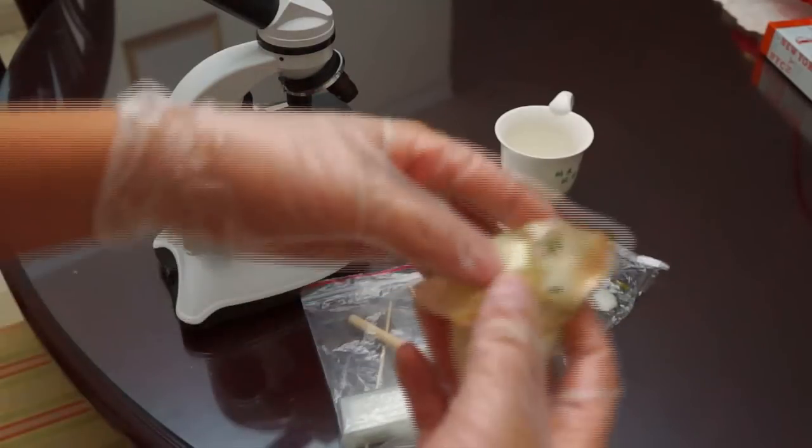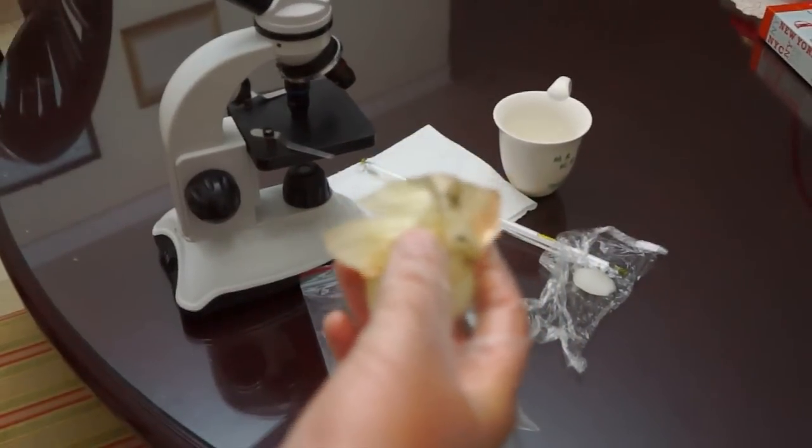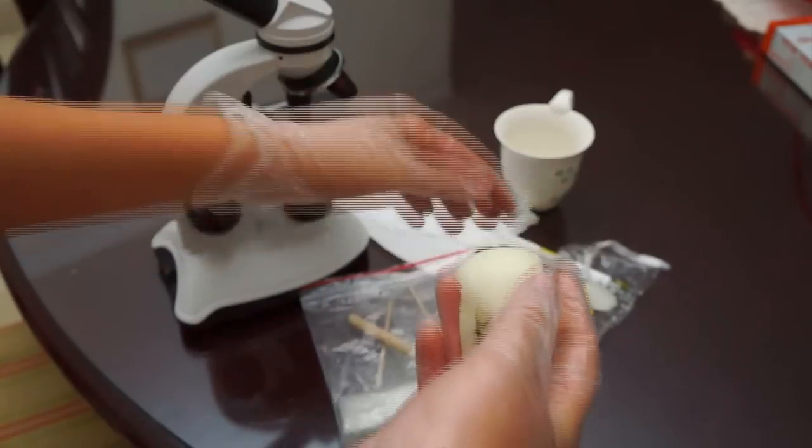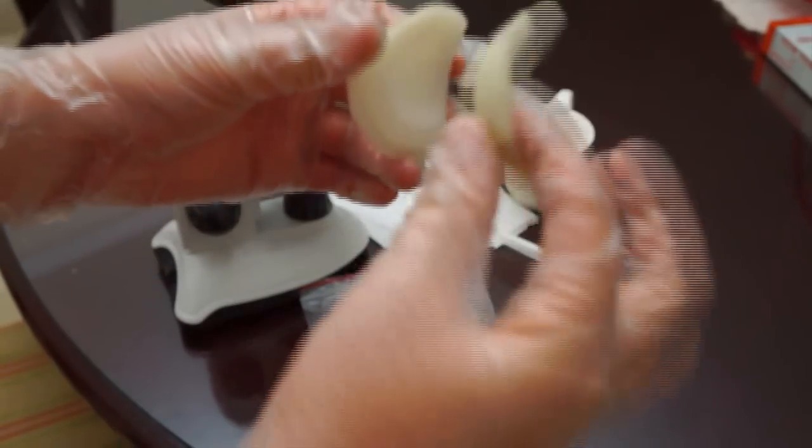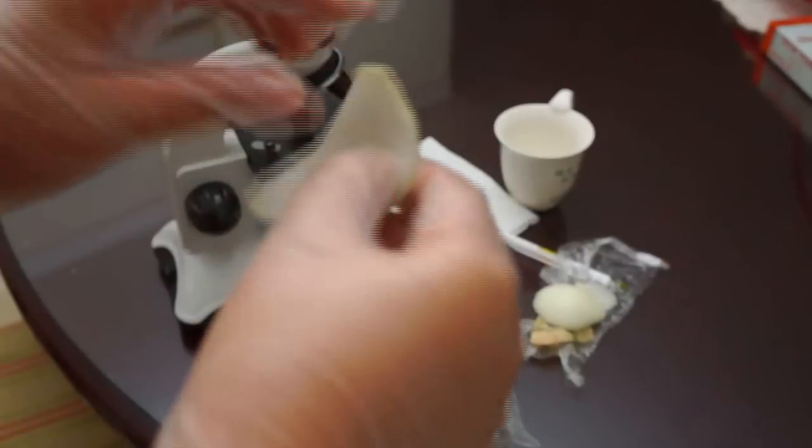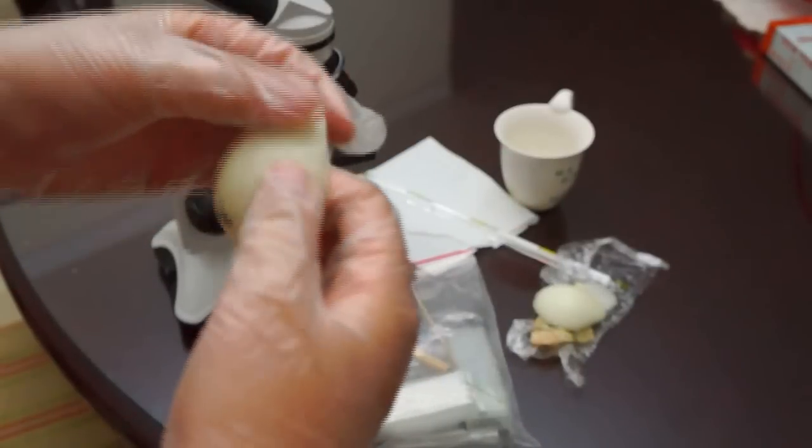First we are going to take out what we don't need from the onion or the outer core. We do not need this brown thing. We do not need the inside core either, only the crust, the part that we see on the outside.